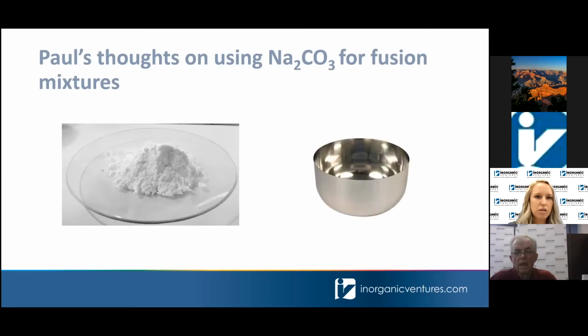I'm just going to let Paul talk a little bit more about using sodium carbonate for fusion mixtures and why we like to use this.